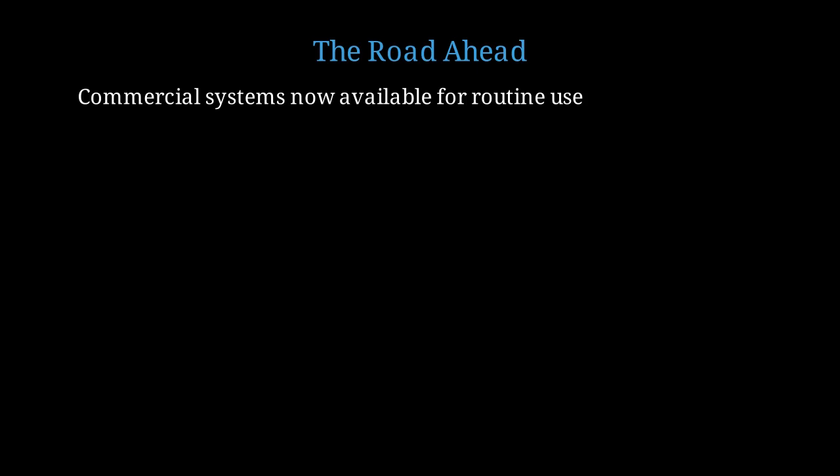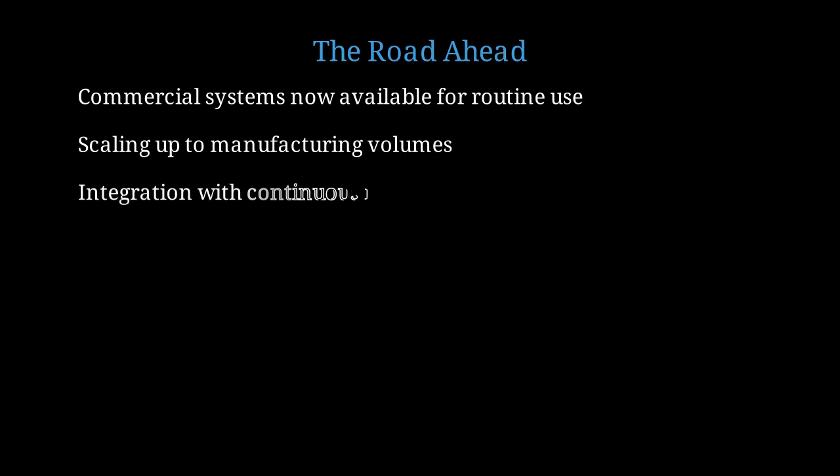The field of microfluidic emulsion generation is rapidly maturing from laboratory curiosity to industrial reality. Commercial systems are now available that make this technology accessible for routine use in research and development. The challenge now is scaling up to true manufacturing volumes while maintaining the exquisite control that microfluidics provides. We're seeing integration with continuous manufacturing paradigms, particularly in pharmaceutical production, where the FDA is encouraging continuous processing.